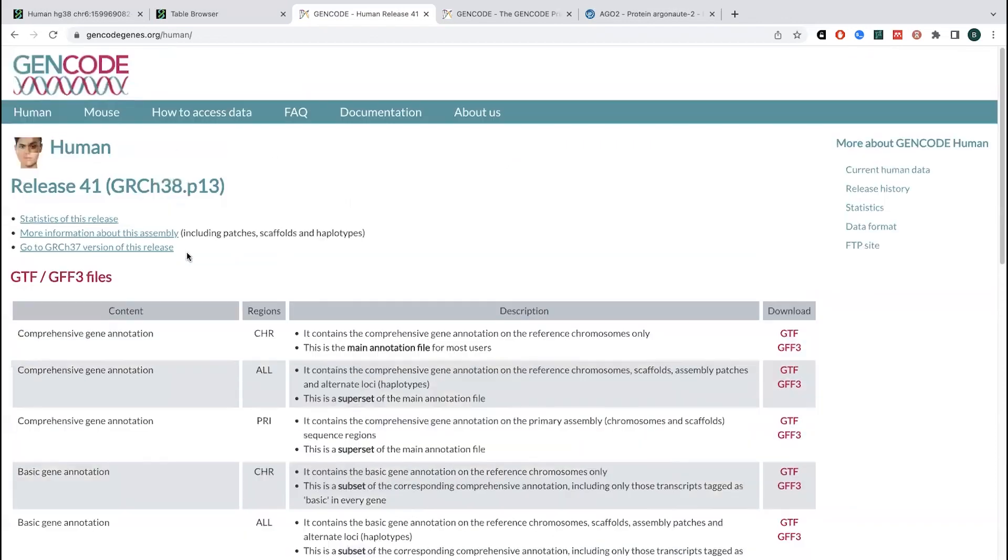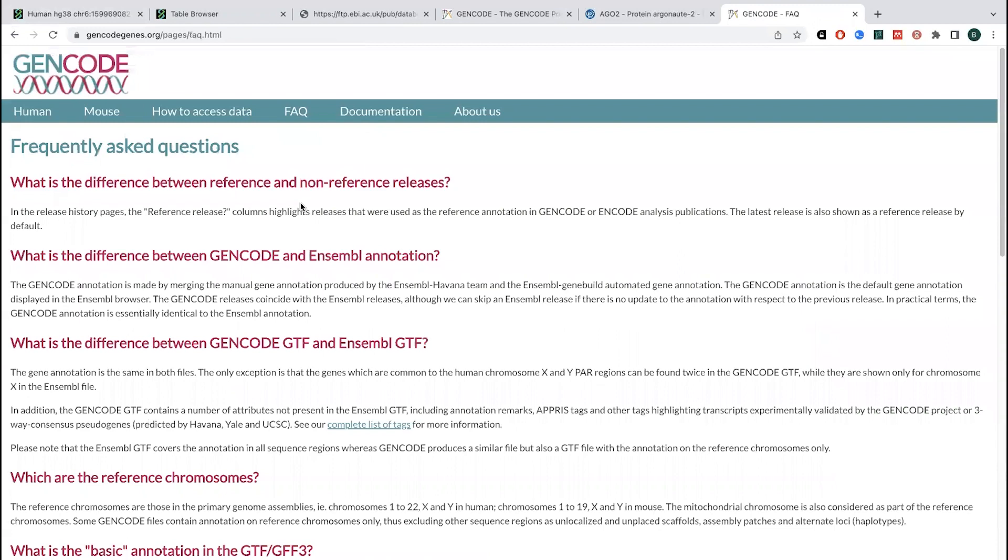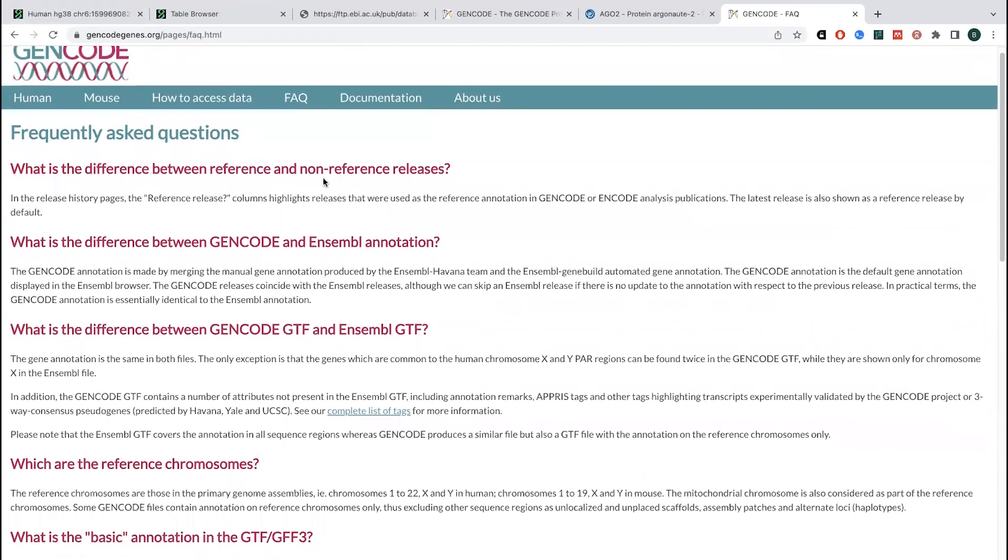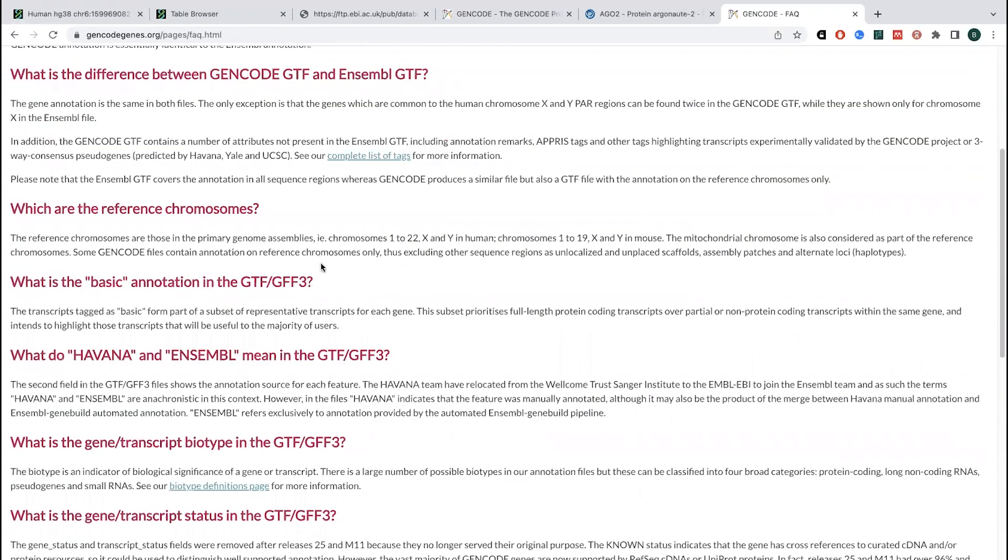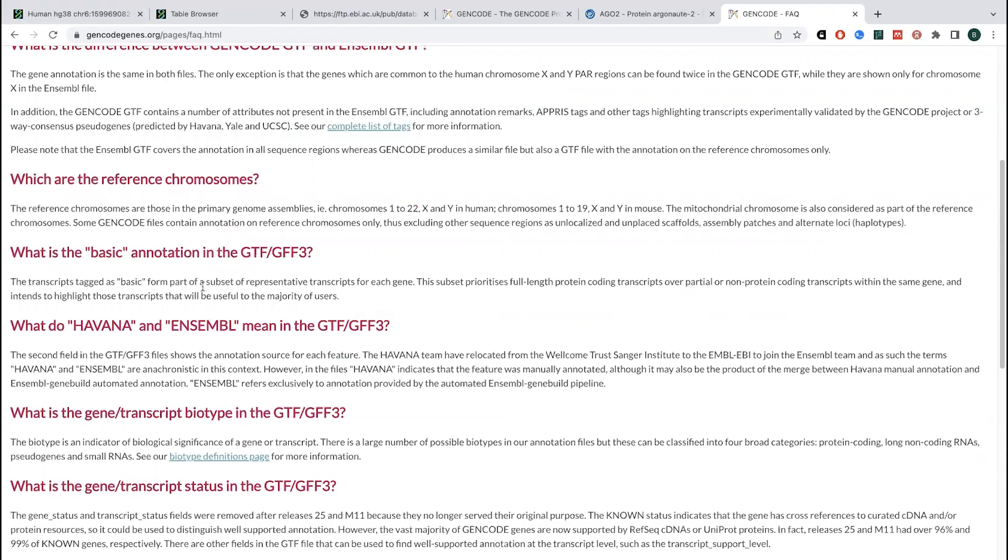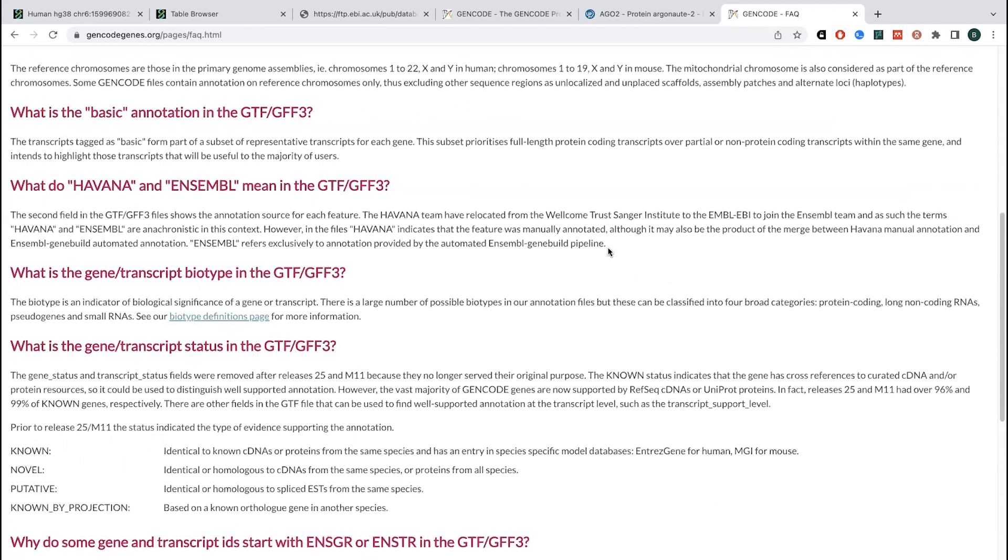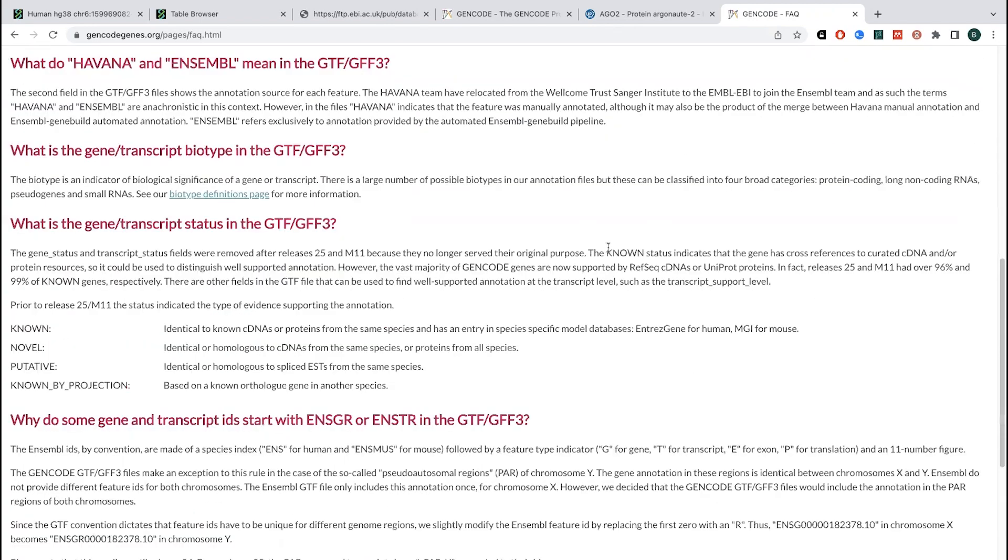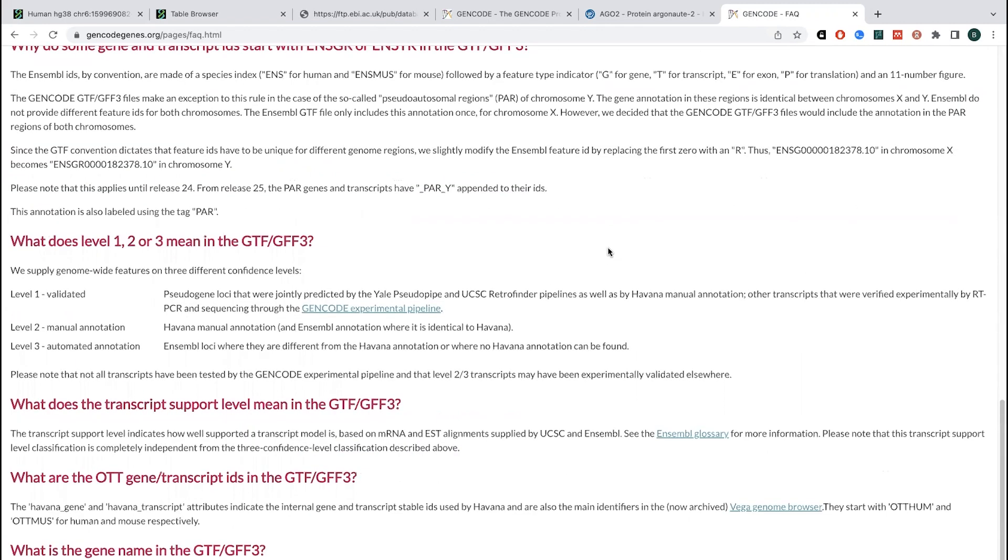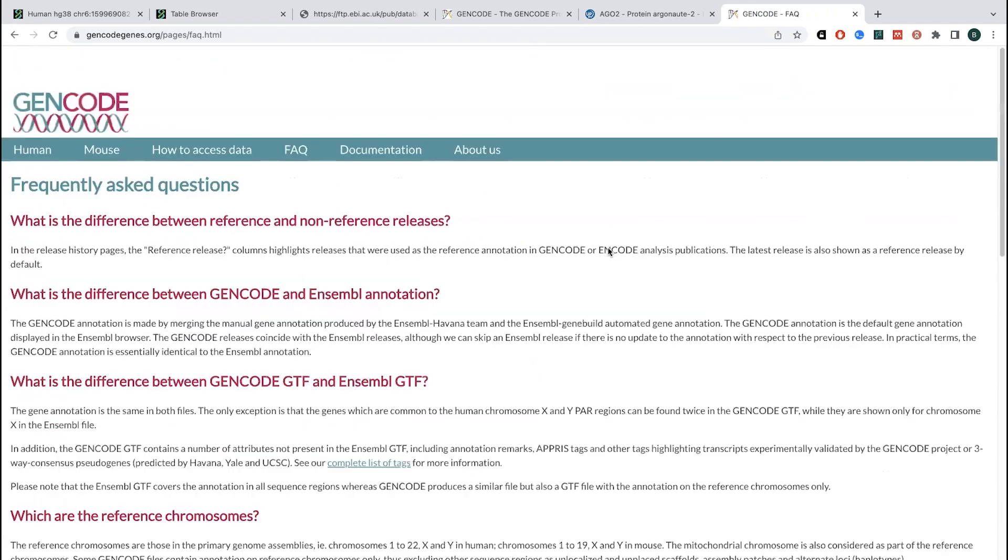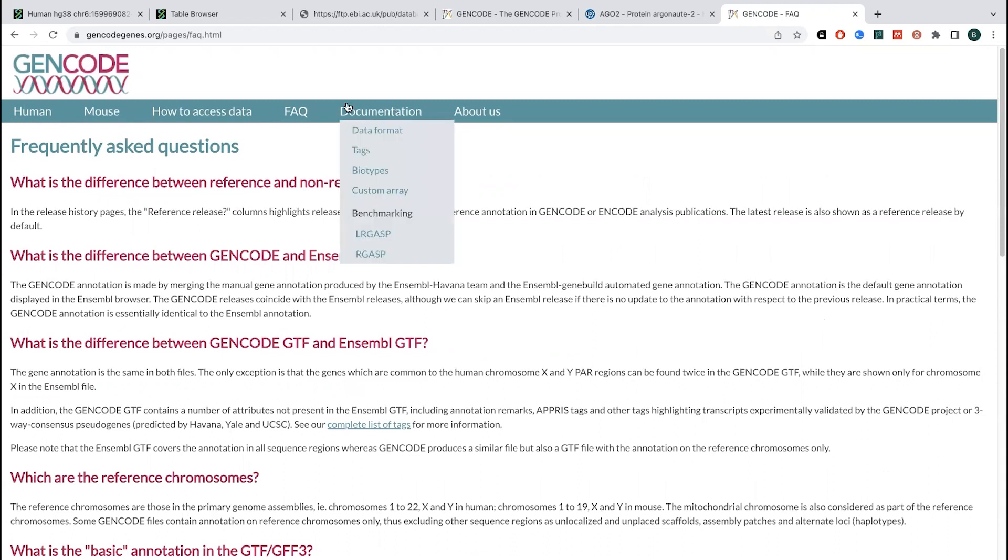And if you want more information about them, so if you go to the FAQ, you can see some of the differences between various things. So basically it's telling you that the basic transcripts are a subset of all of the representative transcripts, prioritizing full-length protein coding transcripts over partial or non-protein coding transcripts. And so that will be what you get for the basic versus the comprehensive where it'll have a lot more things.